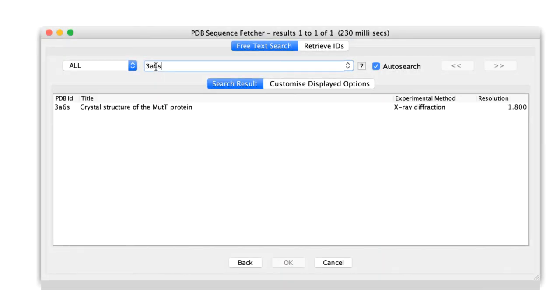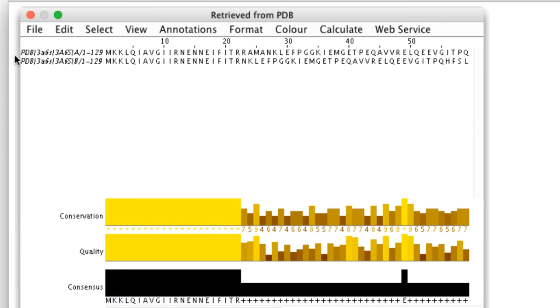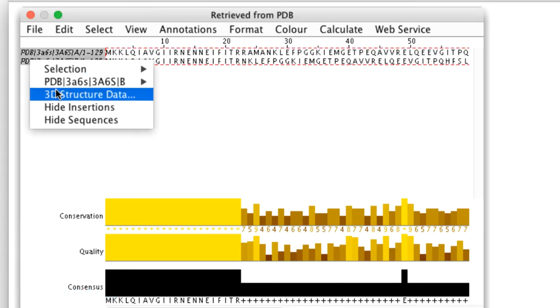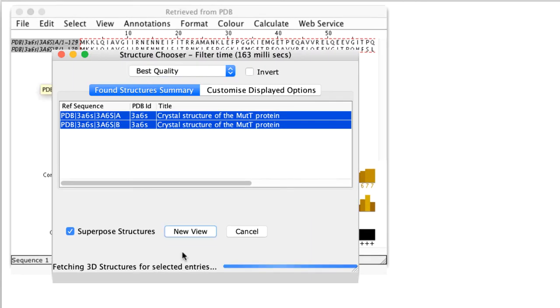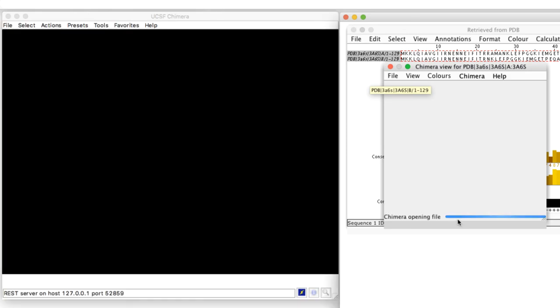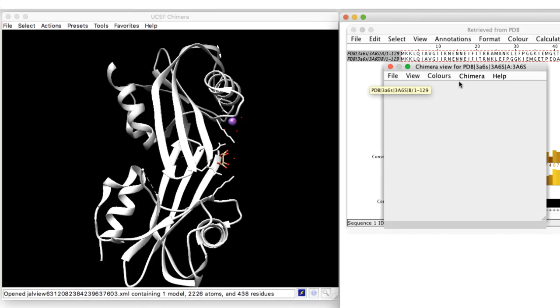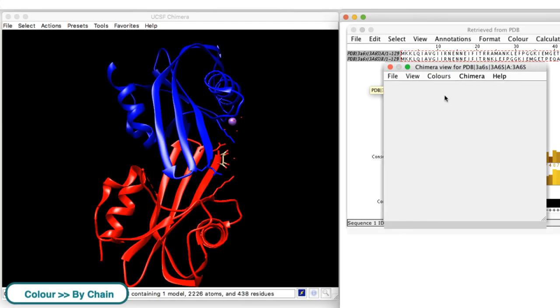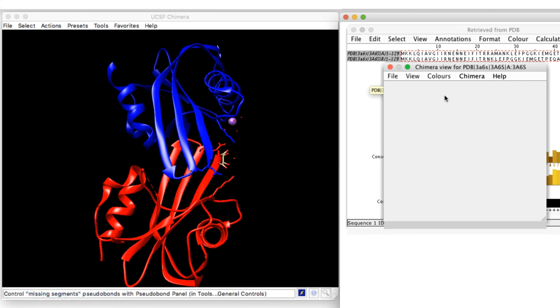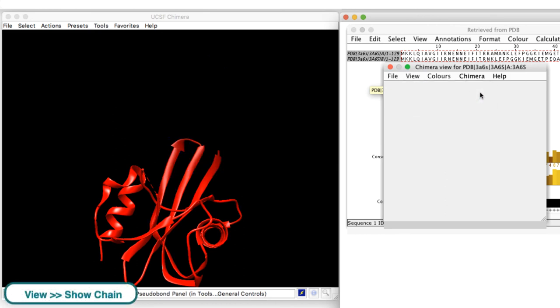To illustrate how to alter the appearance of structures in a viewer, I will fetch the protein file 3A6S and read the structure into the Chimera viewer. This protein has two chains. I can assign different colours to each chain. I can view the structure as a single chain or the chains together.